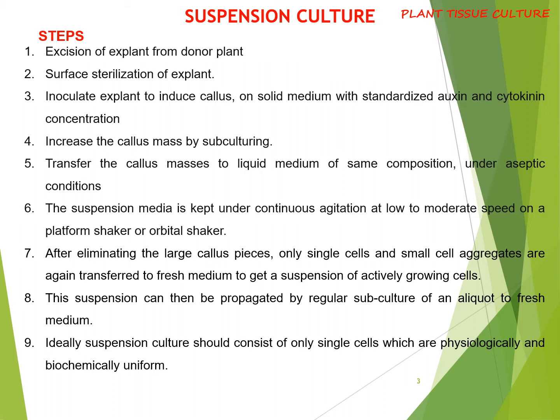Then the callus is transferred into the nutrient media with the same composition under aseptic conditions. A friable callus is preferred for suspension culture. The suspension media is then kept for incubation under continuous agitation at a low to moderate speed.